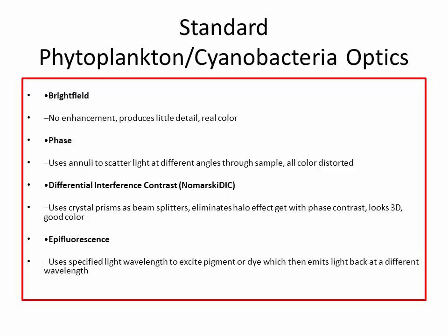And then sometimes epifluorescent attachments to scopes work too, because a lot of algae have natural fluorescence, and cyanobacteria are very good at this. In fact, if you had a field sample full of different kinds of algae and they were all round, epifluorescence would light up the cyanobacteria, and you could see which ones were cyanobacteria. But again, epifluorescence adds a few $1,000s to the cost of the scope as well. But about the minimum you need is phase.